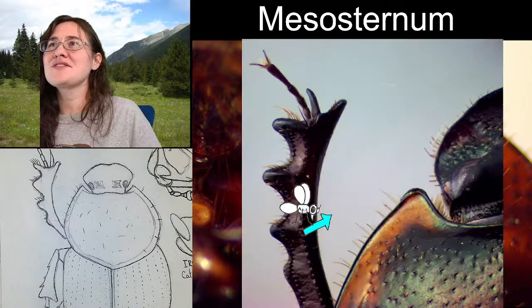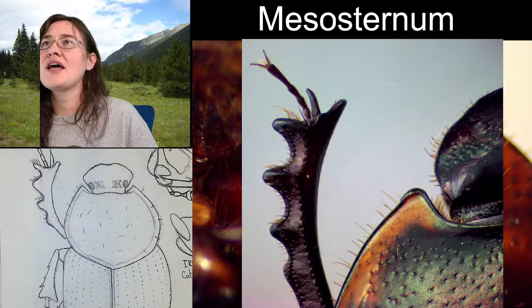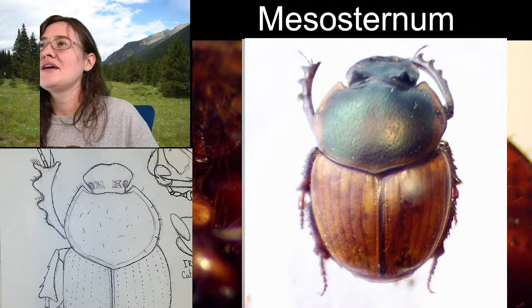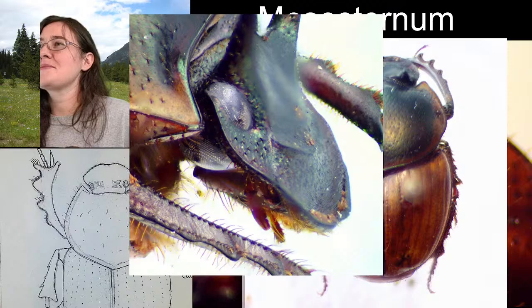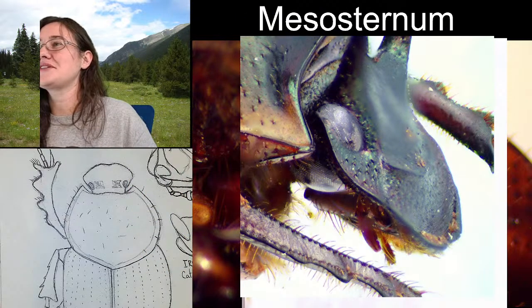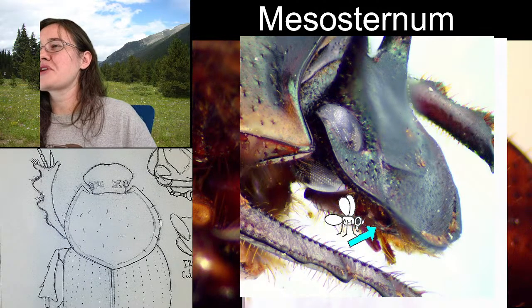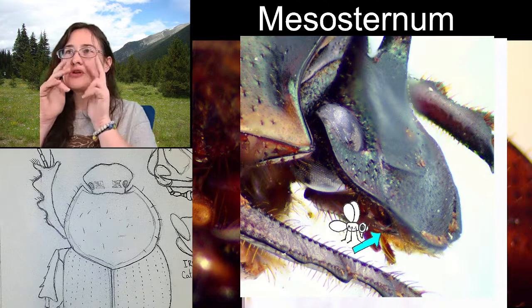All right, what else did I have? I had this picture of the leg. I had this picture of the body. And then I had this picture of the head. So we got to see all of them. Good, good, good. And from this, you can actually see up here, I believe that those are mouth palps. Those are palps up here.